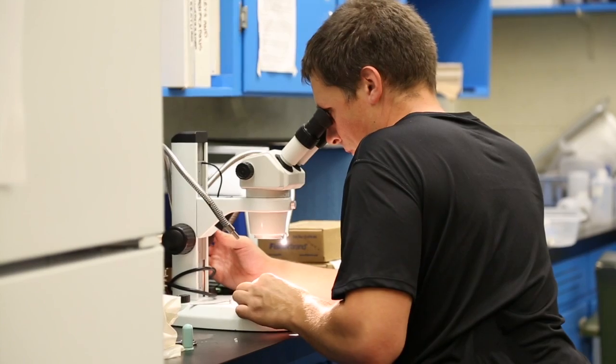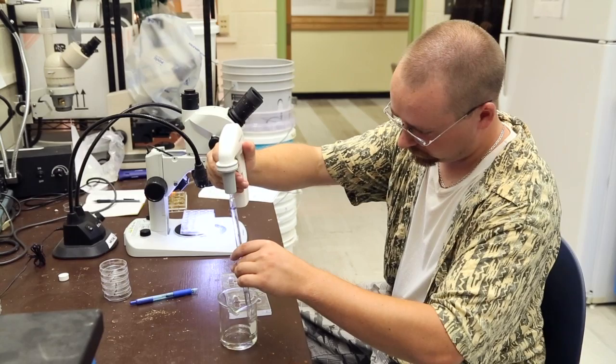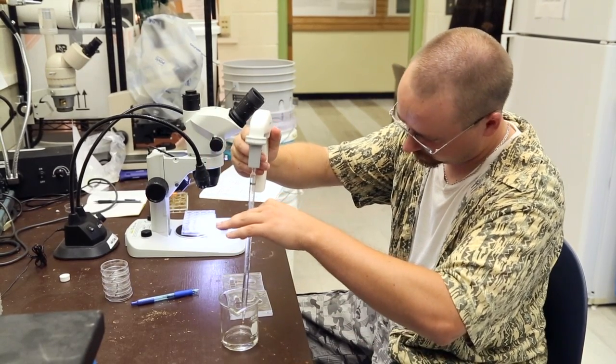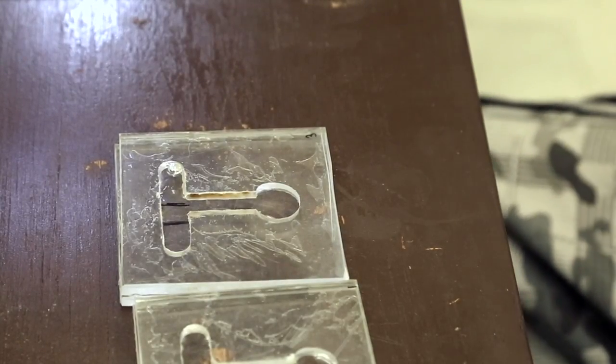So what we're trying to do is make an artificial host. I've made something that's never been made in the world before. I've made snail jello. That's just collagen extracted from snails.